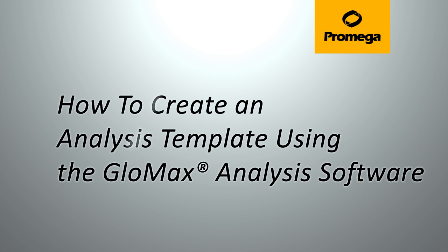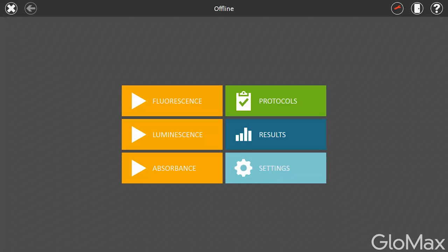In this video, we will describe how to create an analysis template that can be saved, reused, modified, and exported using GloMax analysis software.